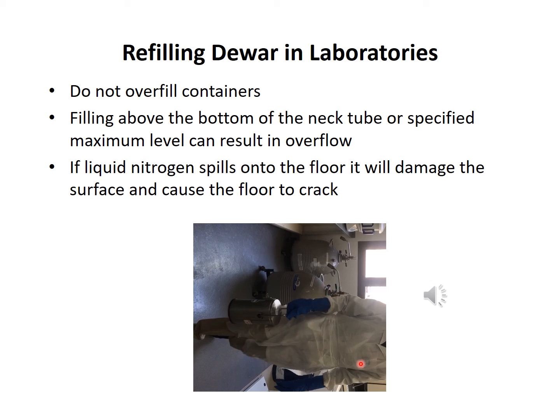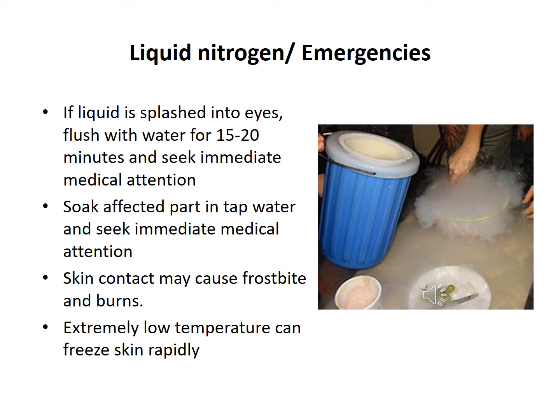Even if your body is safe, the surface or ground where you are working is not safe if it overflows. In the case of liquid nitrogen splashing into the eyes, although there are fewer chances, while you are working, for example grinding plant tissues or other tissues with a mortar and pestle, sometimes the liquid nitrogen can splash into your eyes. There are always chances. So what happens? You don't need to be more worried.